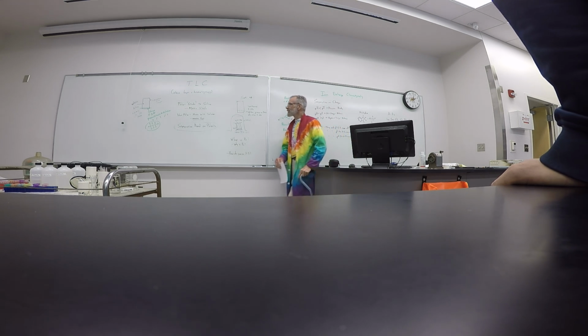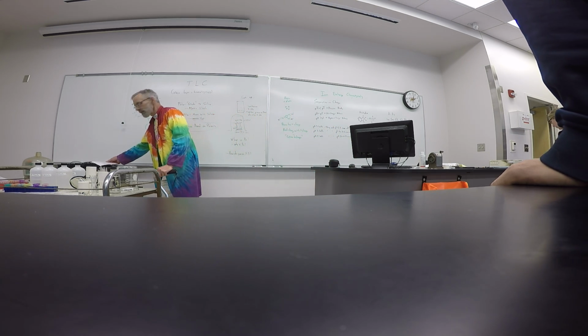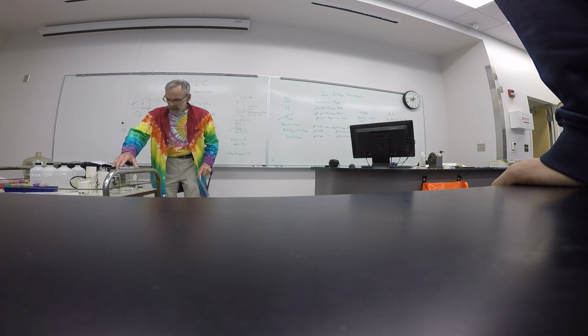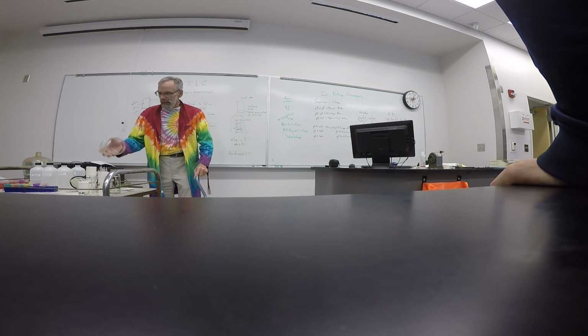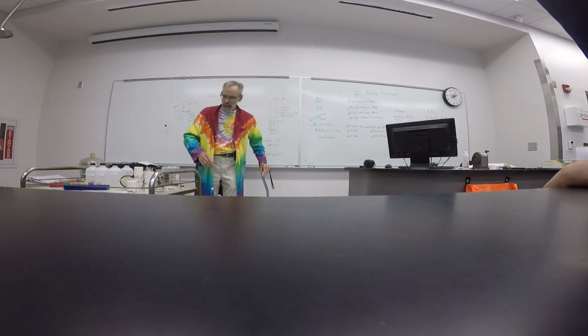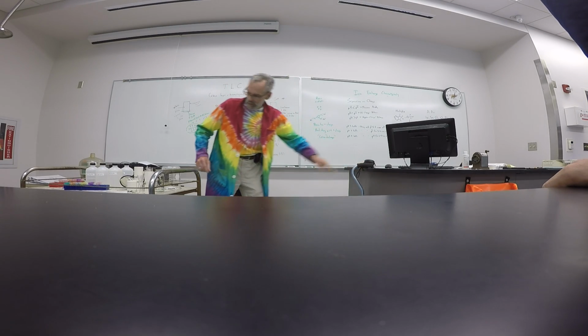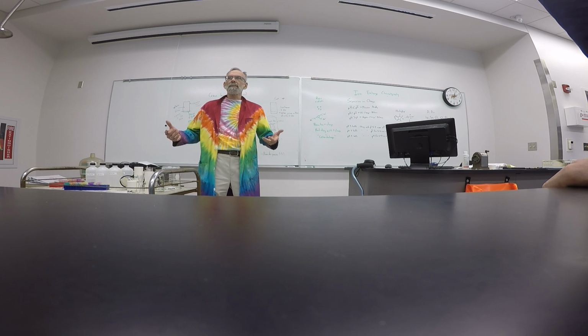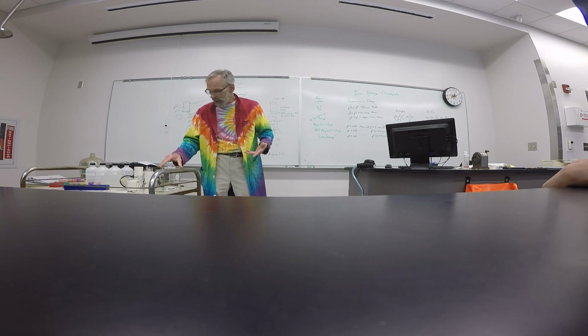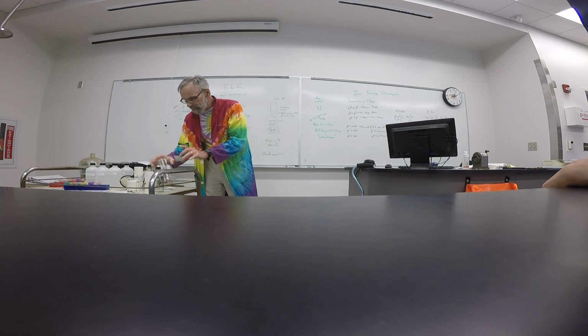Well, let's just start with the basics. What you're going to be using is media right there. And I put it under this glass just so you don't go up and accidentally touch it. And first things first, when you pick this up and use it, any special technique I have to use? Don't touch the gel. Don't touch the gel. So you have to pick it up carefully from the edges, like that.